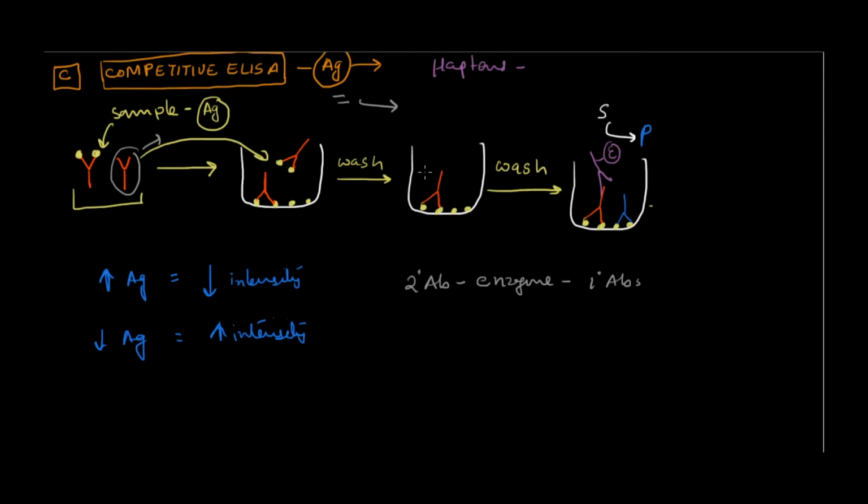If I have to produce conjugated primary antibodies every time, it is going to increase my work and the cost of that production. Every time I'll have to have specific conjugated antibodies for a different antigen. Instead of that, I can have secondary antibodies which have the ability to bind to the Fc portion of antibodies. As I said, let's say they are produced in rabbit, they can bind to the Fc region of any human antibody, right?